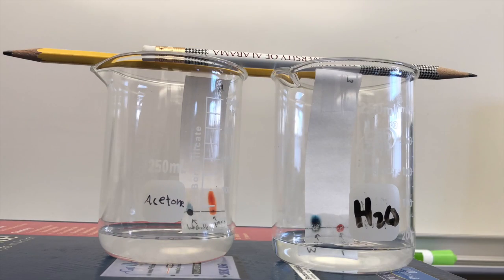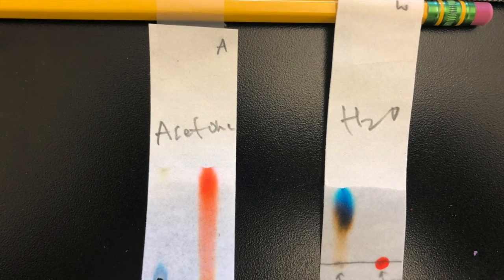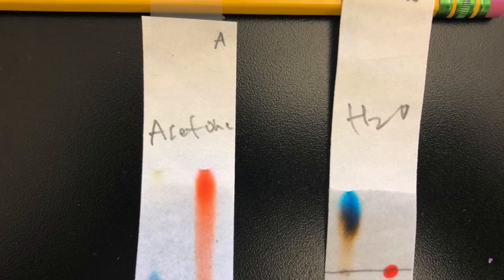Watch as the acetone moves the permanent marker but not the washable and vice versa with the water moving the washable but not the permanent marker. This tells us that the permanent marker is nonpolar and the washable is polar.